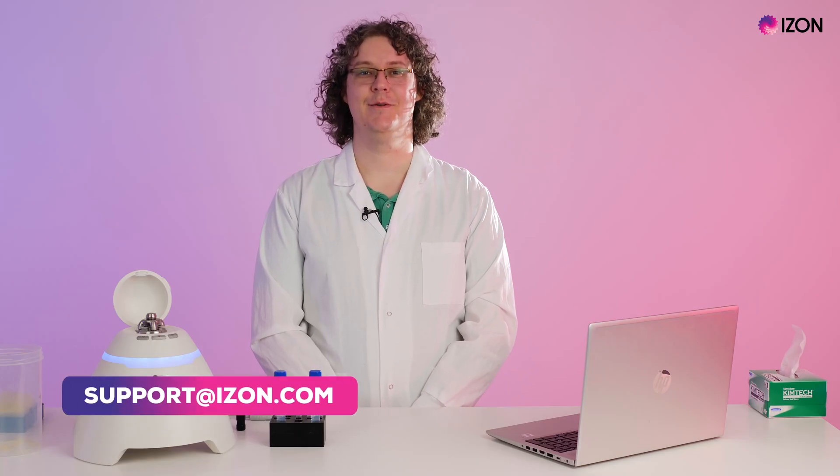The system will now ask if you would like to make one more measurement or if you would like to finish. If you are making multiple measurements, it is recommended that a zeta calibration should be repeated every two to five samples to account for any changes to the system over time. Select finish to return to the home page when you are done measuring samples. Please contact us at support at izon.com for more information or if you have any questions.